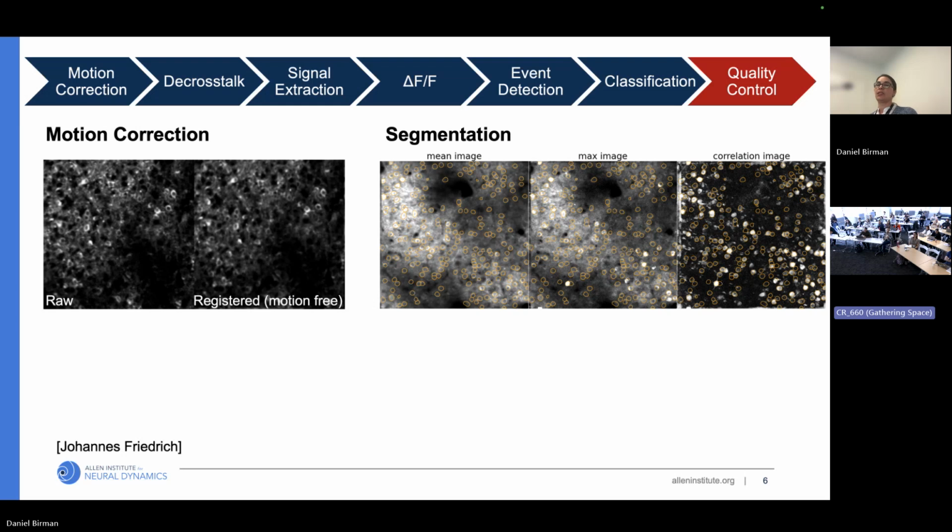So this segmentation is actually kind of interesting. When I was talking about flexibility before, we designed this capsule, and I shouldn't say we, Johannes Friedrich did here at the Institute, where you can actually set certain parameters to either run Caiman or Suite2P, and within those two types of segmentation and extraction, you can then tune any of the parameters necessary to get really well-defined cells.